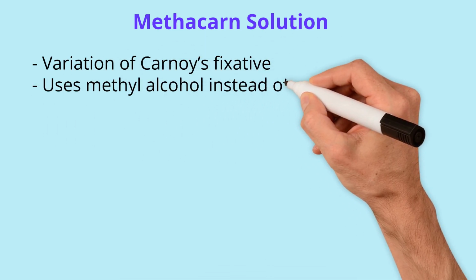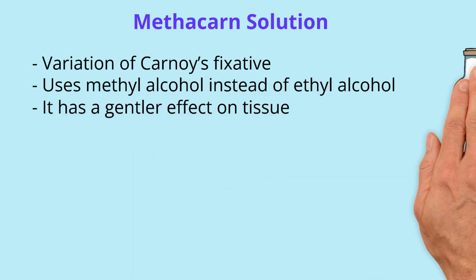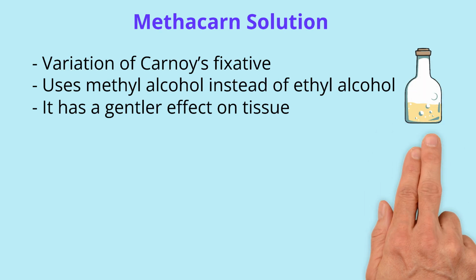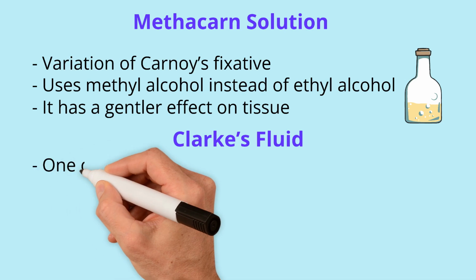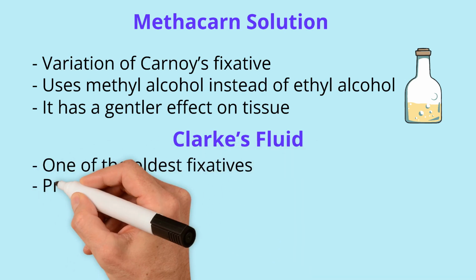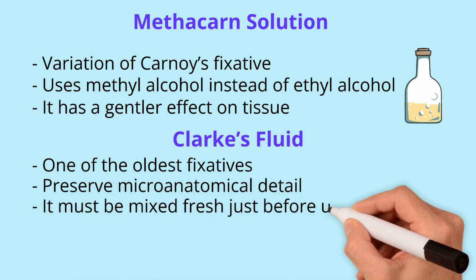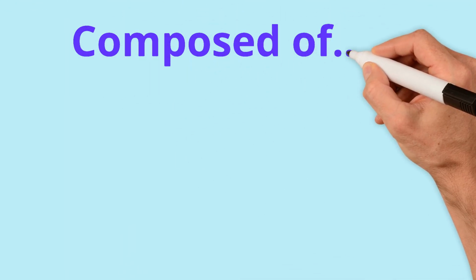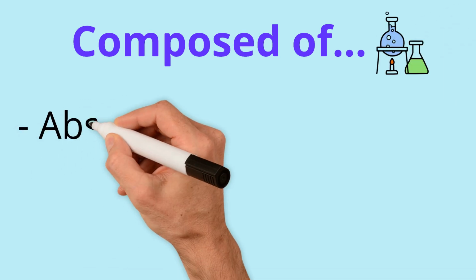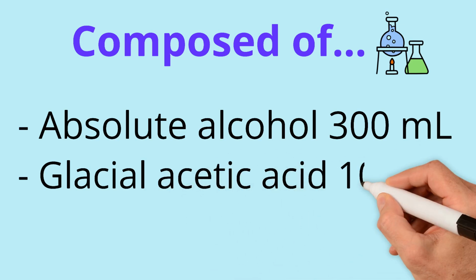It results in less shrinkage and hardening compared to Carnoy, and it is preferred by some histologists for its gentler effect on tissue. Clark's fluid is one of the oldest fixatives still in use. Clark's fluid consistently ranks high for preserving microanatomical detail under light microscopy compared to other fixatives, and it is especially effective for paraffin processed tissue. It must be mixed fresh just before use for best results, and it is composed of absolute alcohol and glacial acetic acid.